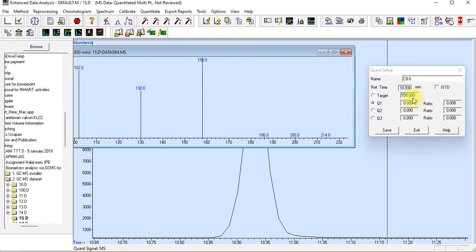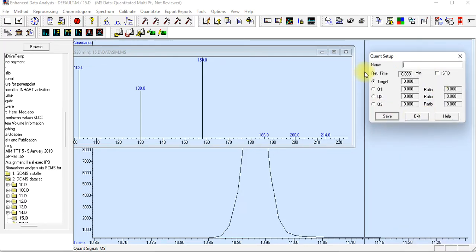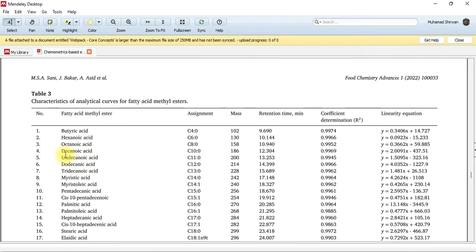Okay, if this is done, let's go to register the third compound, the last compound. Click save again. There is a small window asking you to register the third compound, so you close this mass spectra window first. What is the compound name?